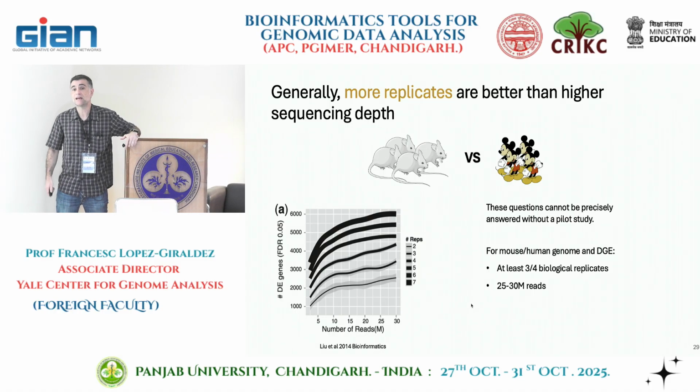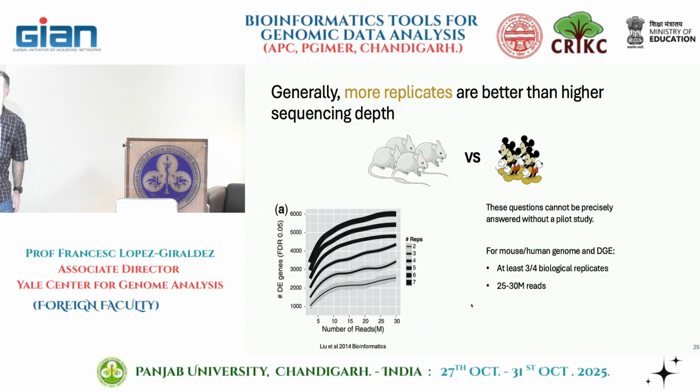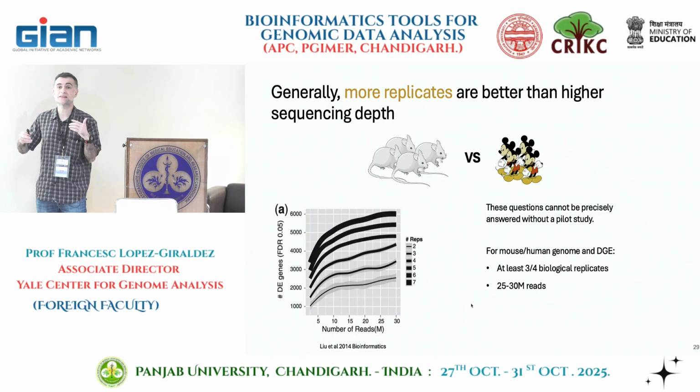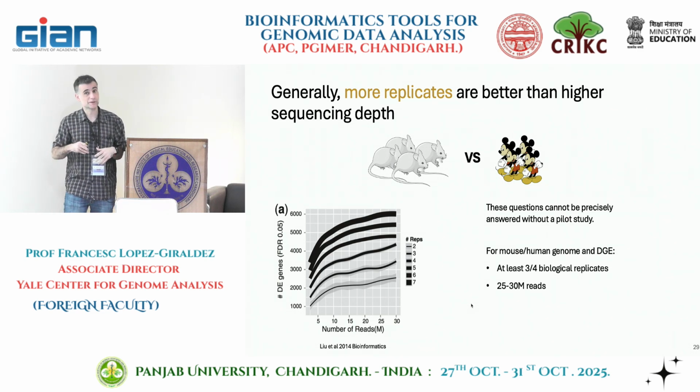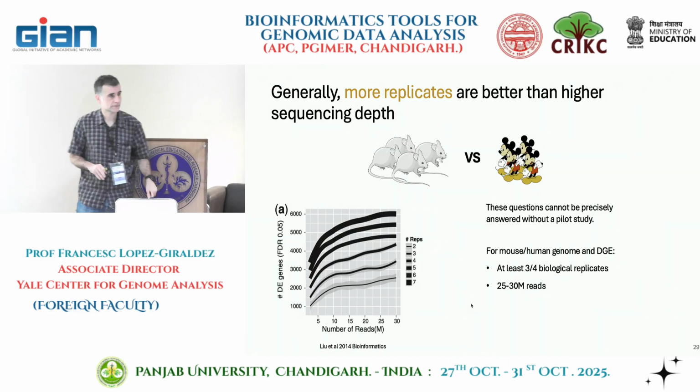Yeah, if you're trying to save money in that sense, yes. So this is what it's telling you. Less sequencing, you're not sacrificing that much, but removing a replicate, you may be sacrificing a lot, right? Does it apply to any genome? It depends on your goals a little bit, again. It applies to any type of sequencing, whether whole genome or whole exome.